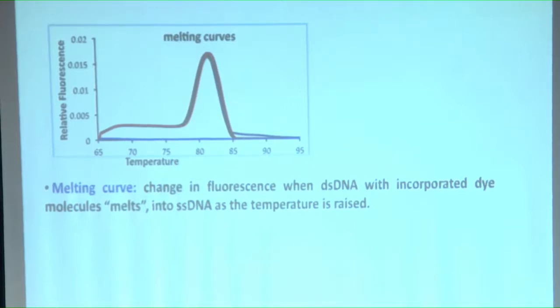It is so important in the case of SYBR Green based qPCR, where you have to get a single melt peak, right? If you get a single melt curve, that indicates that the primer is the most accurate primer for the target, right? If you have multiple targets, multiple amplifications that contributed to the overall SYBR Green fluorescence, you will see multiple peaks. In this particular curve, everything is single, right? That means the primer has only one target. Upon melting, it created a single melt curve.